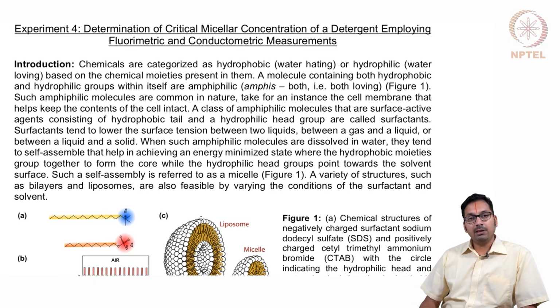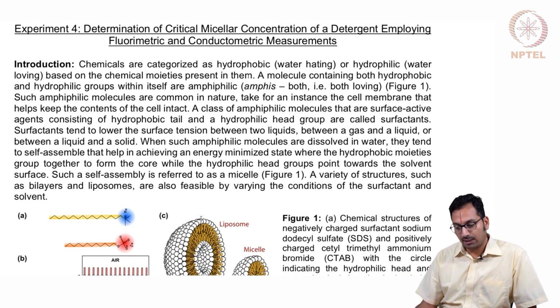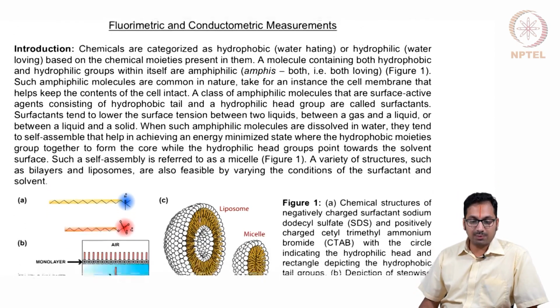So let me be also clear in the fact that we will not be describing the idea or the chemistry behind the techniques that are being used, for instance the fluorimetry and conductometry. The basic introduction that we had in the last class should suffice for us to understand whatever we are trying to do. Okay, so let's quickly recap.